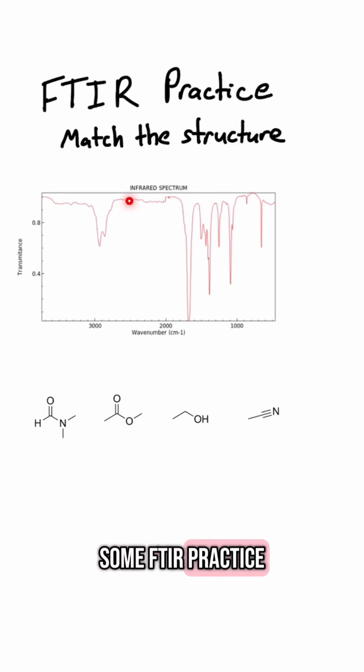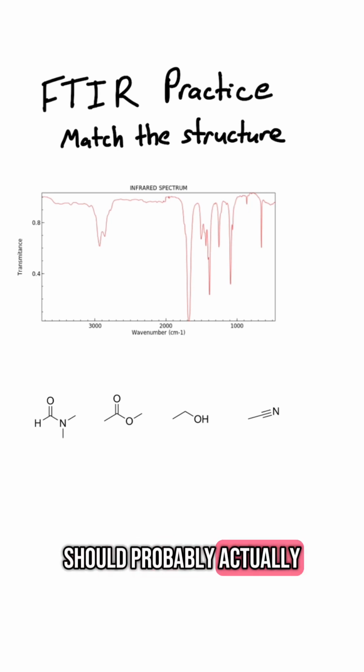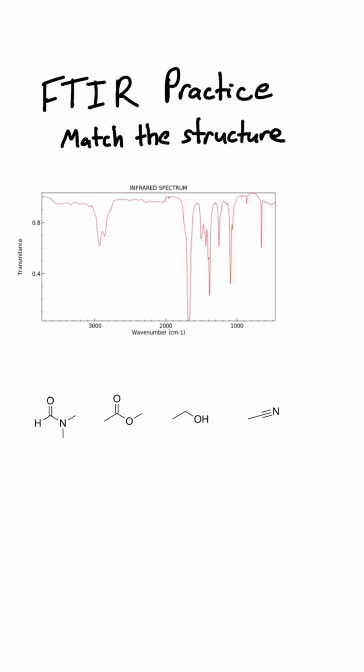So let's do some FTIR practice. If you're brand new to FTIR, you might want to go watch a basics video before you go through this. If not, stick with us. You'll learn just fine. And I should probably actually make an FTIR basics video. Also, if you want to pause this video right now, screenshot it and work it out on your own and come back, that's great too. See if you get the right answer with us.